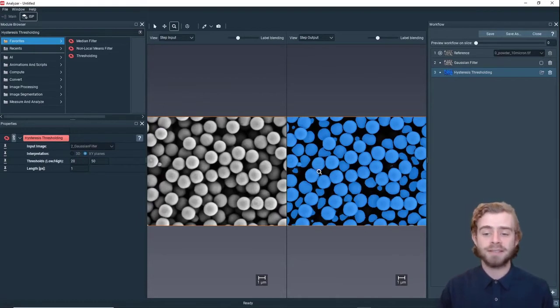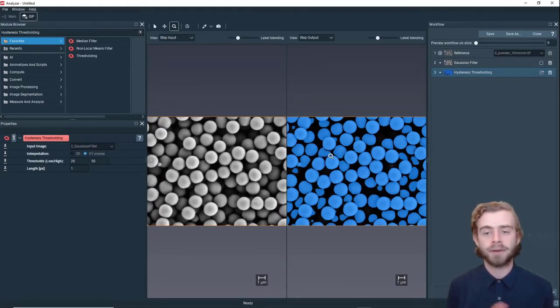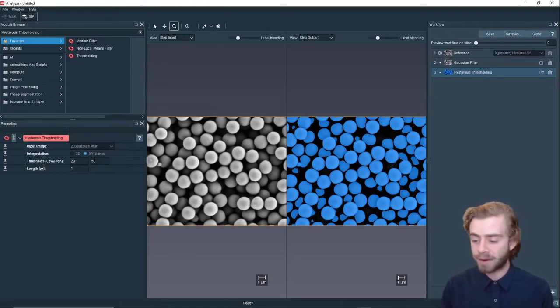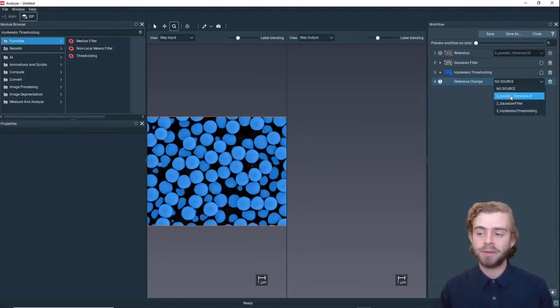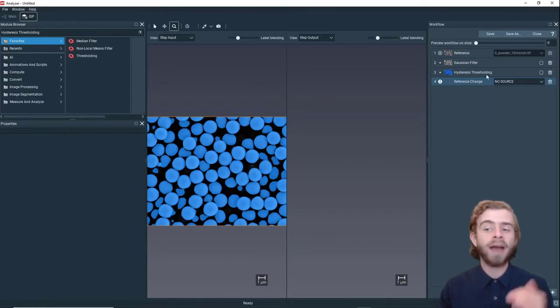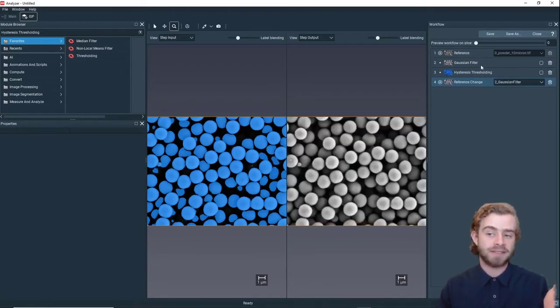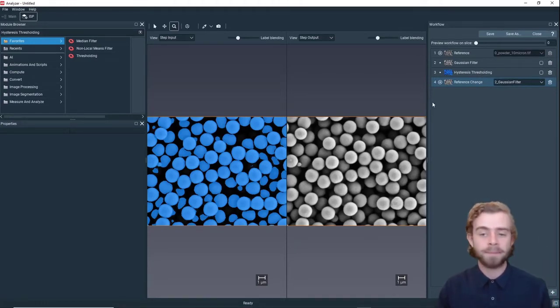To fix this we're going to create a mask of the edges of each particle. To do that we're going to insert a Reference Change step. What this allows us to do is instead of going in a linear progression, we can step back to a previous step. In this case we're going to step back to the Gaussian filter and use it as the input to the next step.